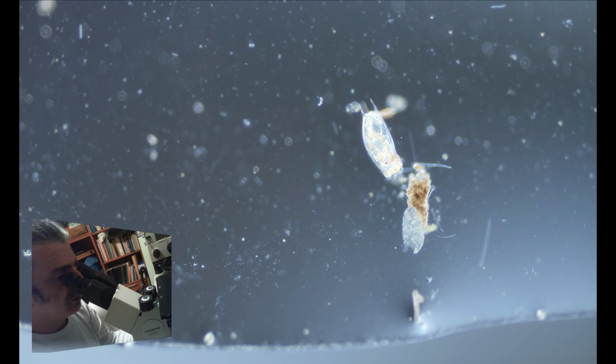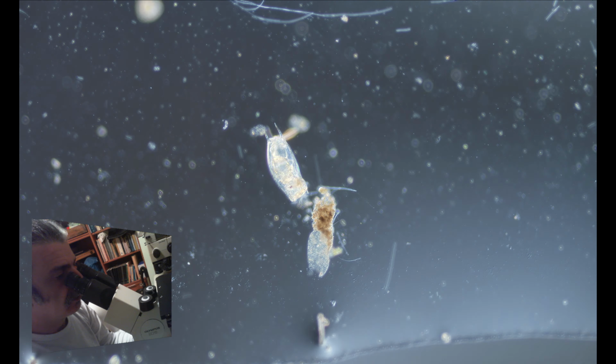Okay, let's go back to 10. Here are two rotifers.